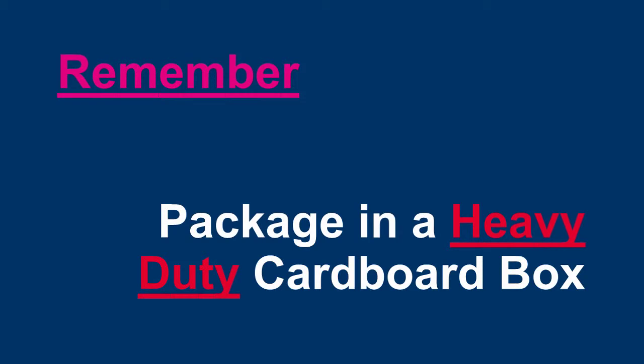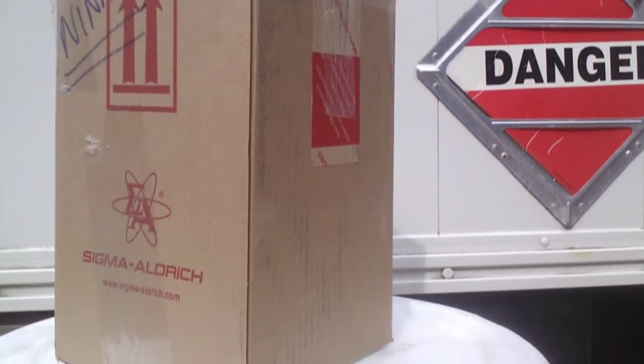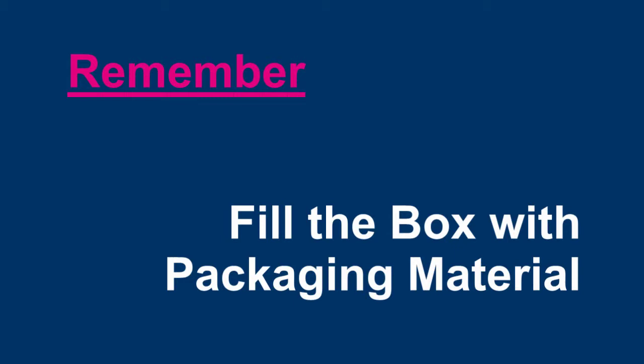We ask you to reuse shipping and packaging material from your lab. Choose a strong and heavy-duty cardboard box. Make use of boxes with appropriate size and dimensions for your packaging purposes. It is very important to fill the box with packaging material. Boxes not packaged properly will not be accepted. This will minimize the chance of breakage when glass containers hit against each other, or leakage from bottles tipping over and sitting on their side during transport.